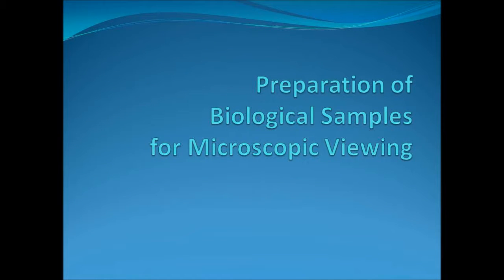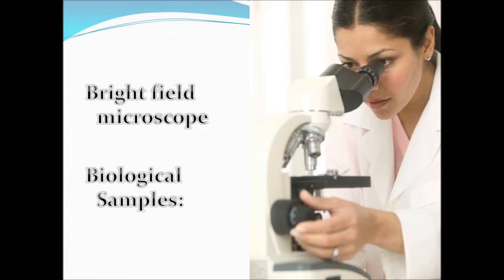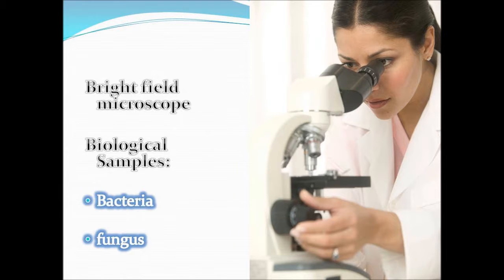This presentation will give instructions on the slide preparation of biological samples for microscopic viewing. These preliminary tests for morphology identification will be viewed under a bright field microscope. We will be looking at the procedures for creating bacteria slides and fungus in mold form slides.